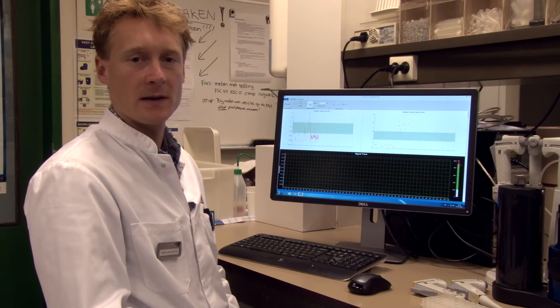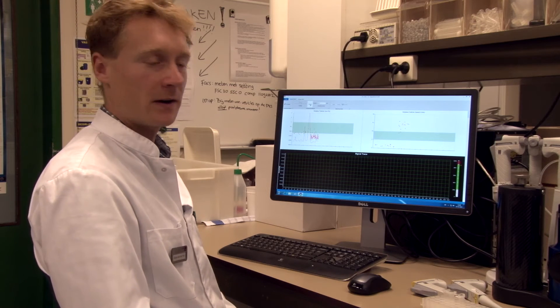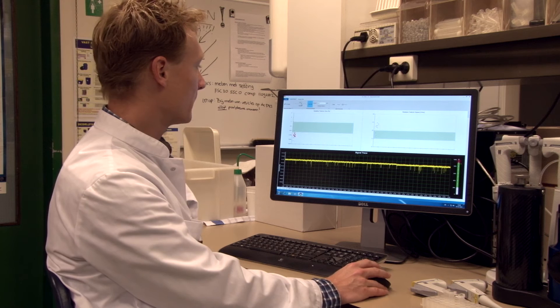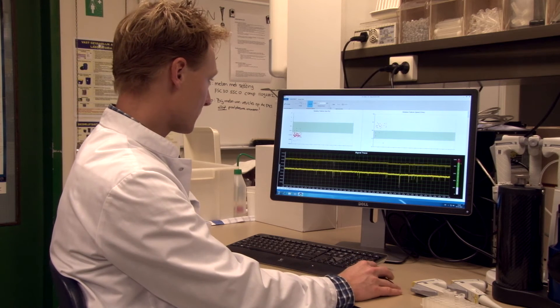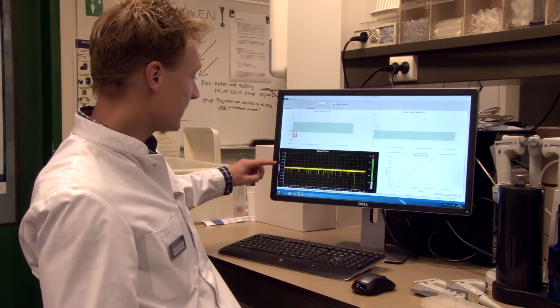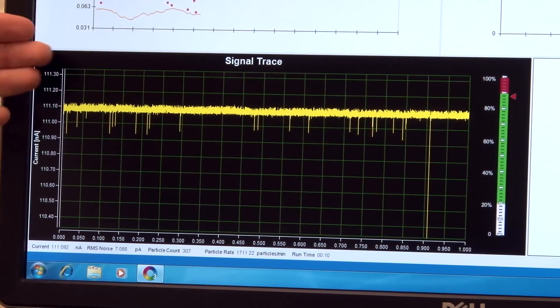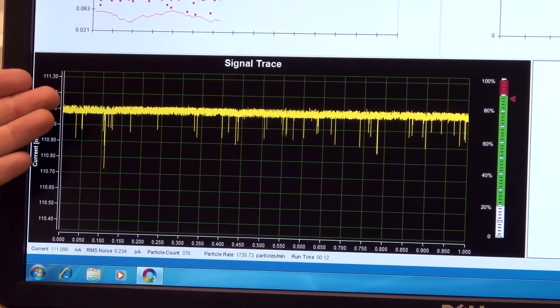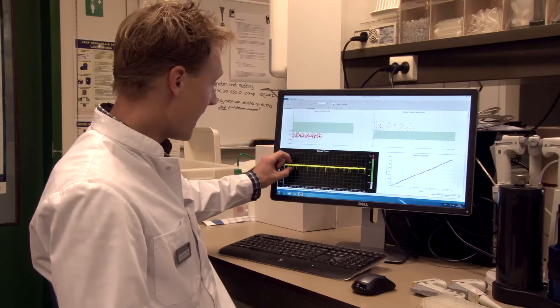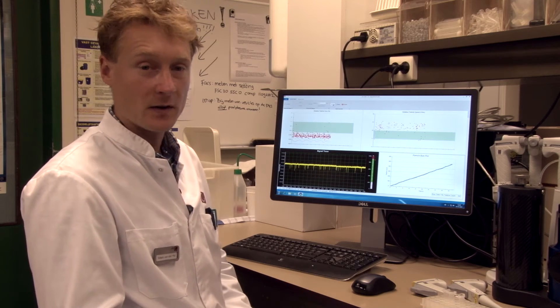We can now start the measurement of the reference material. I will apply a voltage to the nanopore by turning the instrument on and applying 0.4 volts, then press start. On the left you can see the current — a baseline with some noise. The troughs correspond to individual particles passing through the nanopore, and the height of each trough is a measure of the particle diameter cubed.